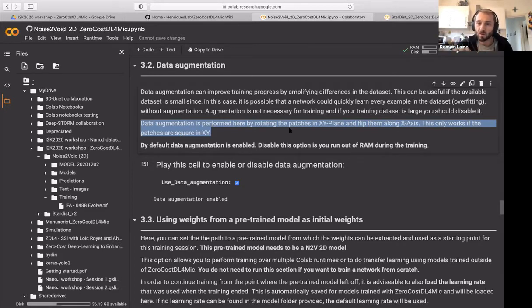In this particular one it is rotation and flips. And of course, it would be straightforward to import code from other notebooks into those sections to implement different types of augmentation. But we've tried to match what was sensible and what we've seen was useful for each notebook, and also what was suggested by the original authors of those individual networks.